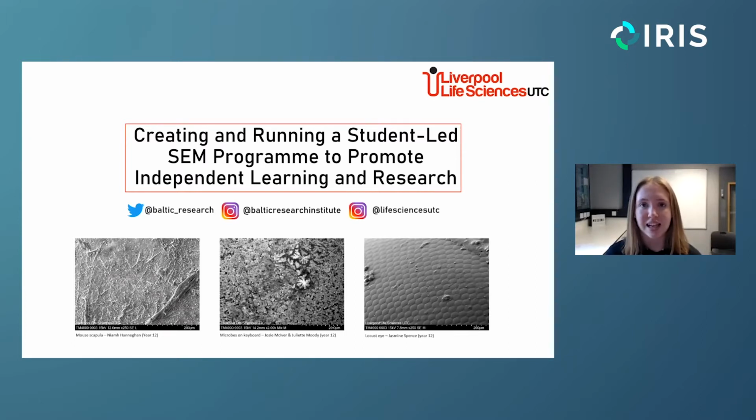So basically, as you can see on the presentation, our title will be creating and running a student-led SEM program to promote independent learning and research, which basically just means it's going to be an explanation of how we've learned how to use the SEM, how we've used it in our projects, and how we've helped other people use and do projects with their own samples.